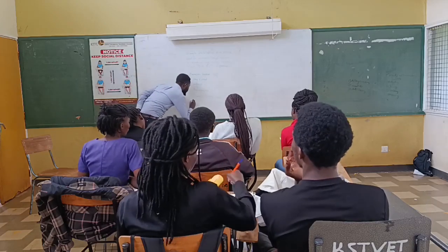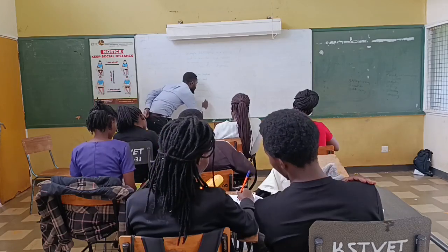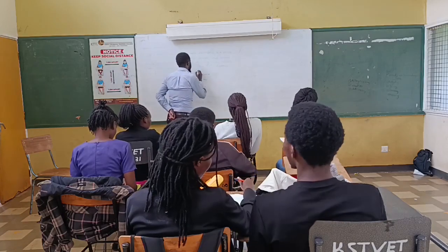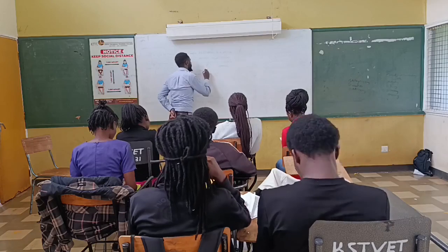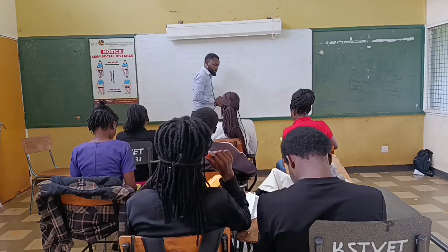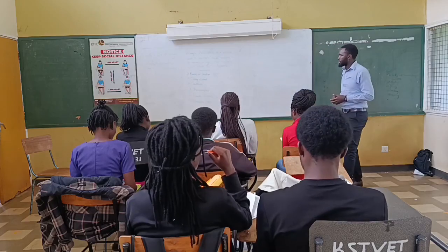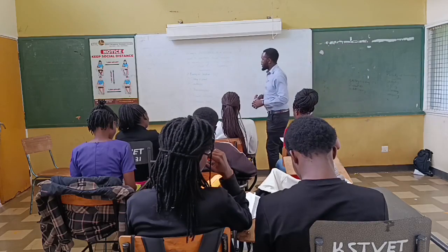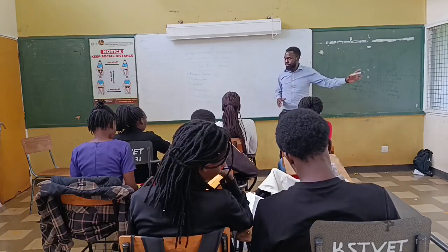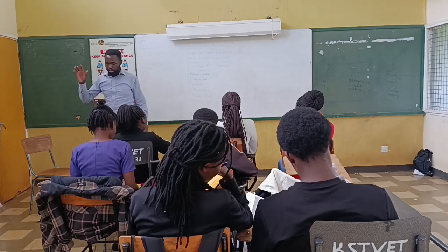Receiving flask. Okay, so these are the components, correct? Yes. Now there are names that go around here. The round bottom flask is the one that is directly heated, and it contains the mixture. And then we have the condenser in between, and then we have the receiving flask.